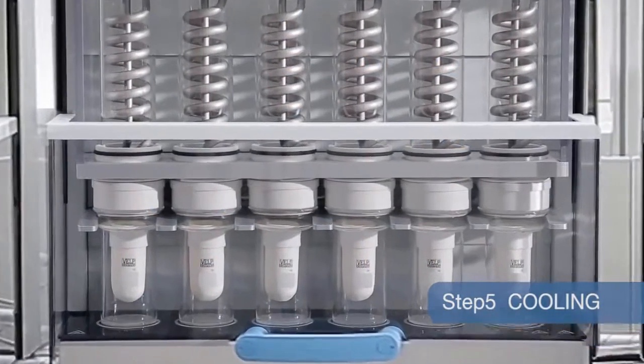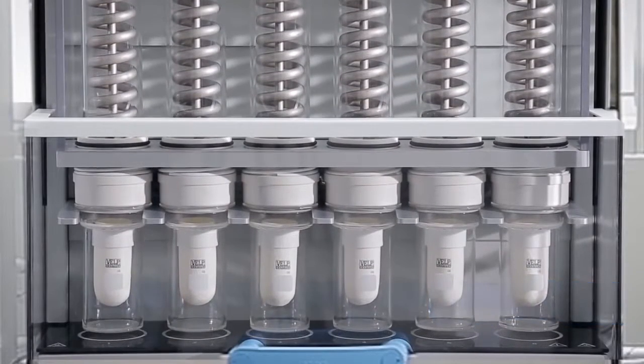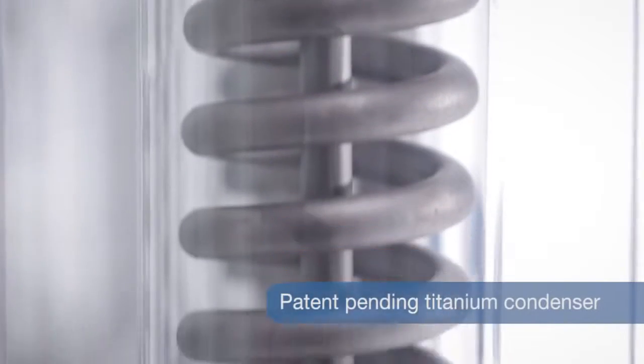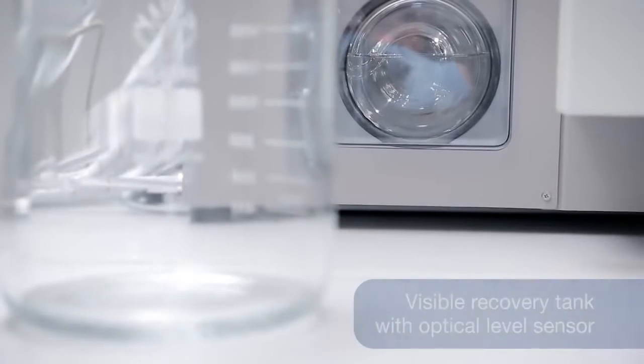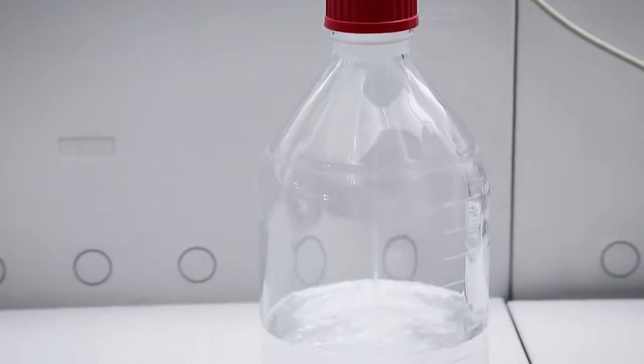The cups are raised to prevent burning. Titanium condensers ensure minimal cooling water consumption and excellent condensation.